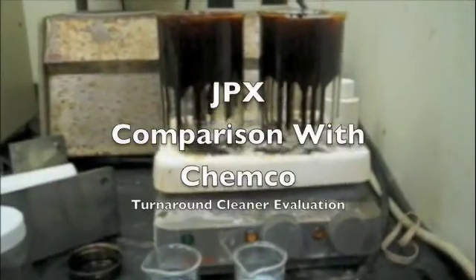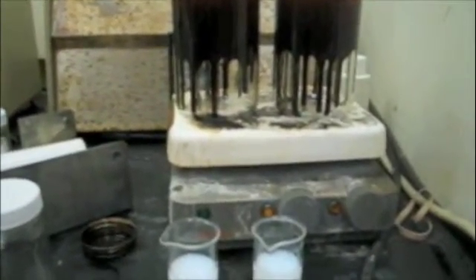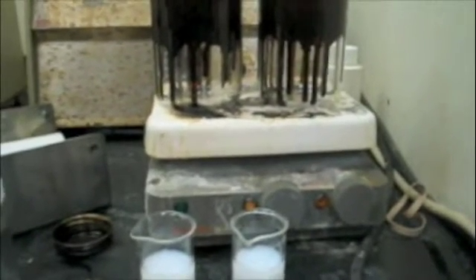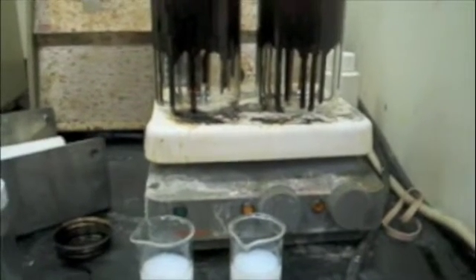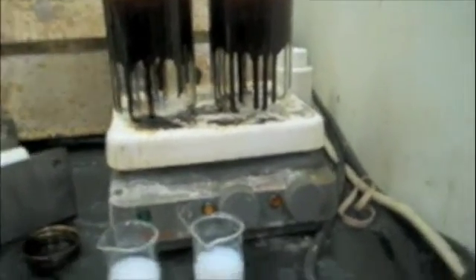This is a test in which we'll evaluate two cleaners in refinery decontamination procedures. What we'll do is take two beakers with the exact same amount of slurry oil from a FCC unit and put in a combination of cleaner and water in a 5% solution, 5% cleaner and 95% water. We'll heat the hot plate up to the point where the liquid will steam, and we'll observe to see how the oil is removed from the surface. Here we see the two beakers when the liquid is starting to get hot and bubble a little bit.